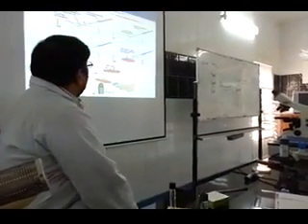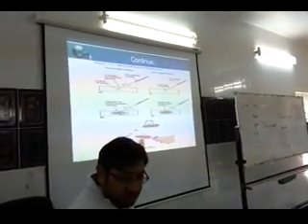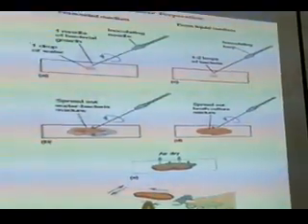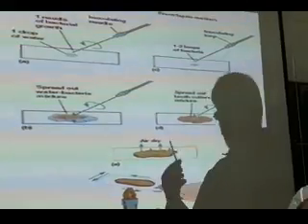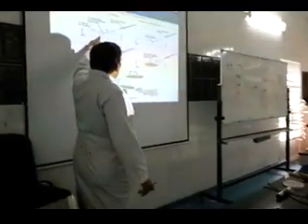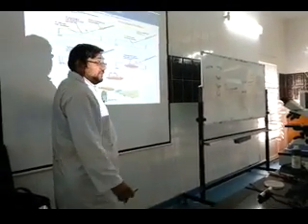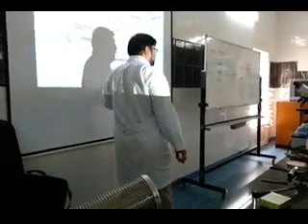Normally for solid we can use the needle also. That's called an inoculation needle. We can use this also for solid culture when you're taking the colony. But it doesn't matter, you can use the loop also. So for solid, you take a drop of water, mix the bacteria, air dry, fix. Okay? For liquid, you just take 1-2 loops, you spread, you air dry and fix. Okay?